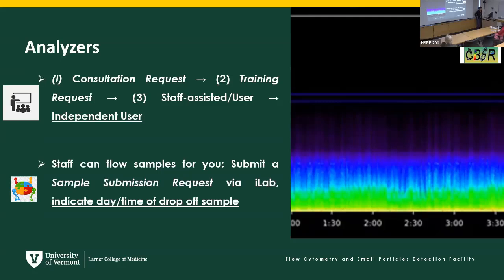You can also provide samples to us, and we will run them for you. In that case, you will need to submit a sample submission request via iLab, and it's very important that you indicate the day and time of the sample drop-off. That doesn't mean that the sample will be run that day, at that time. That will allow us to organize our schedule to provide a time to run your sample, okay?